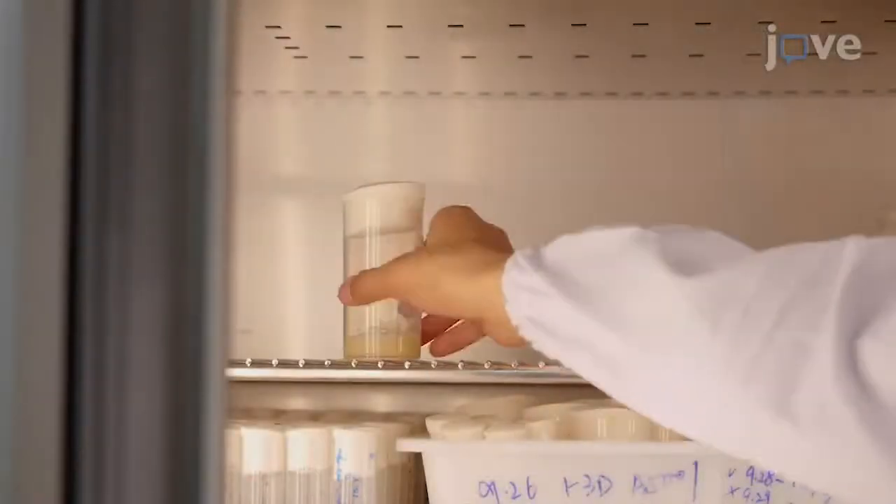Then allow the eggs to develop into the third instar larvae for 84 hours at 25 degrees Celsius with a 12-hour light-dark cycle.